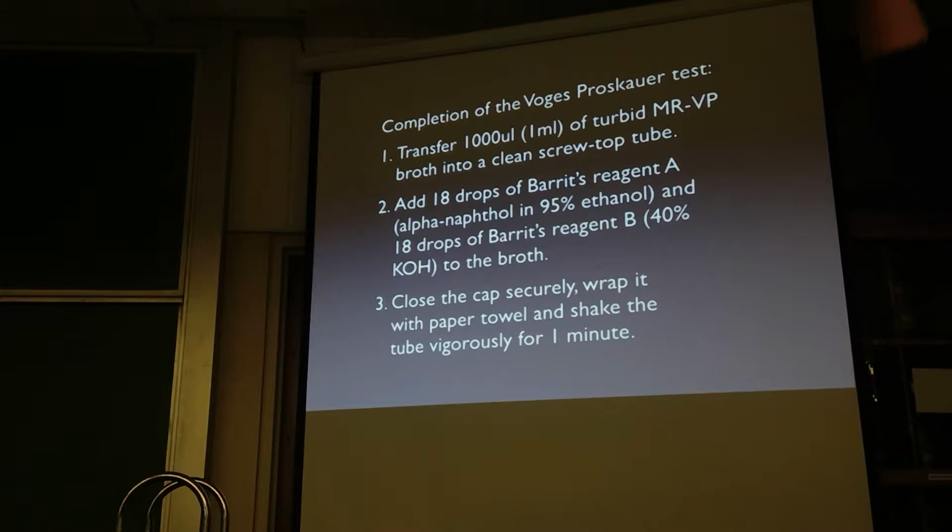What I do with this is put the tip into the liquid I want to measure. I press this plunger to the first stop. When you were using the pipettes with the bulbs, remember I said you have to use finesse? You still have to use finesse. Feel that thing. Don't just push it down, because if you push it down, you don't know what volume you're going to be using. You push it to the first stop. You want to feel that. You can hear it. There's also a little line out here that shows you where it should stop.